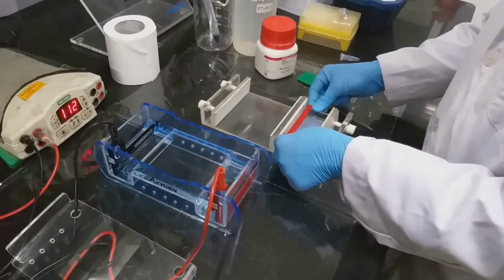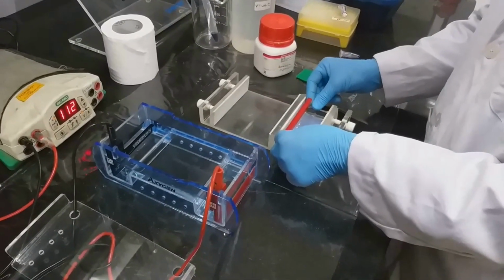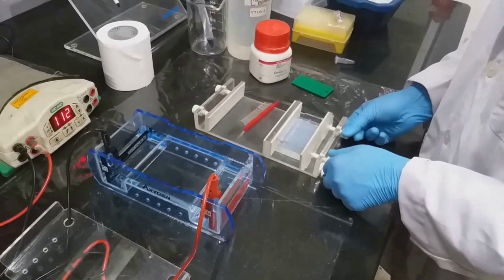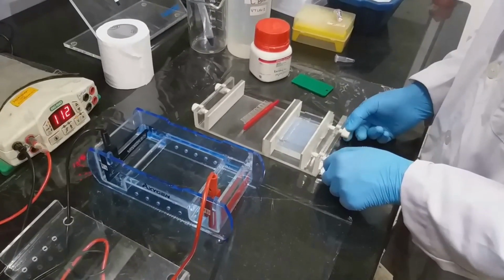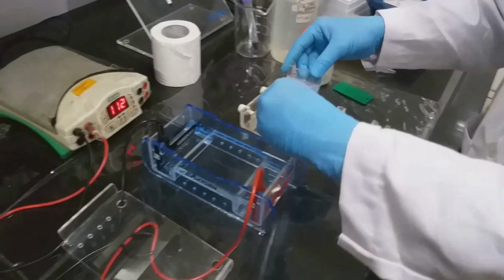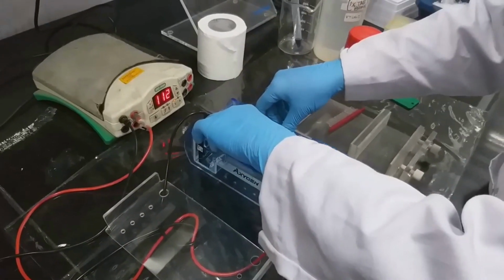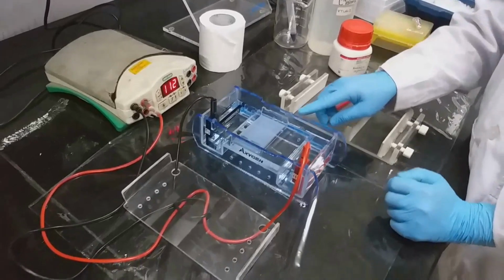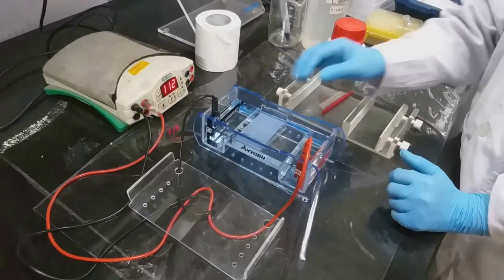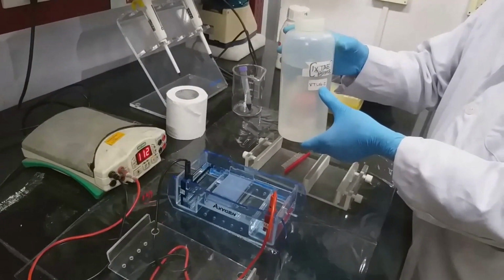We have to gently remove the comb, loosen the knobs, and keep the gel in the apparatus. Make sure that the buffer submerges the gel. We have to fill the remaining part with 1x TAE buffer.